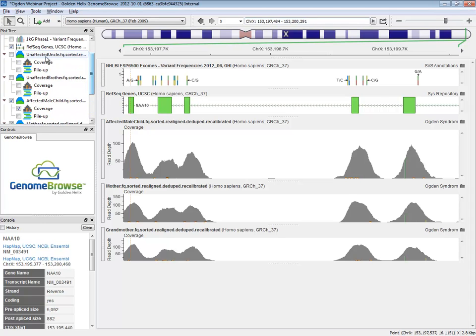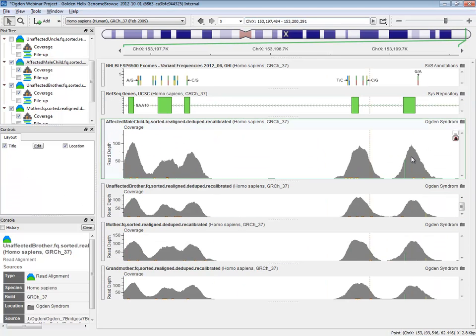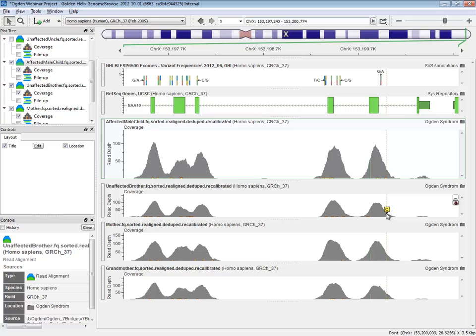Let's add in also, I'm going to unhide the unaffected brother. And outside of the exon, there's another variant here that was inherited from a heterozygous state to here. So you can see that there is essentially two haplotypes, as we would expect. From our chromosomal rearrangements or from our recombination, the brother got a different set of haplotypes, essentially inherited the chromosome that's represented by this heterozygote here, and the affected male inherited the chromosome represented by this heterozygote. So that's essentially the type of thing we want to do with Genome Browse.